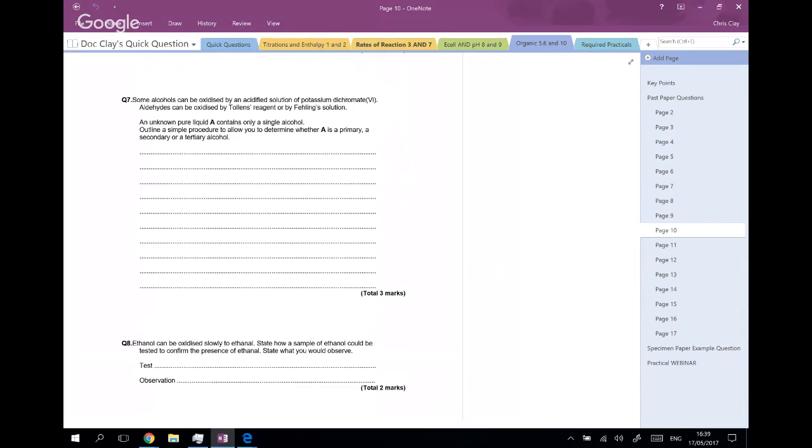Any carbonate would do. Sodium carbonate, both of those would be absolutely fine. Again, testing between primary, secondary, tertiary alcohols, you get a little bit bored of the response after a little while. You end up repeating yourself. But again, don't be complacent.